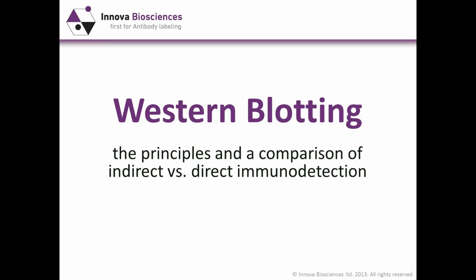Hello and welcome to the 9th episode of the Innova Biosciences webinar series. Today's webinar will discuss Western blotting, the principles and a comparison of indirect versus direct immunodetection.